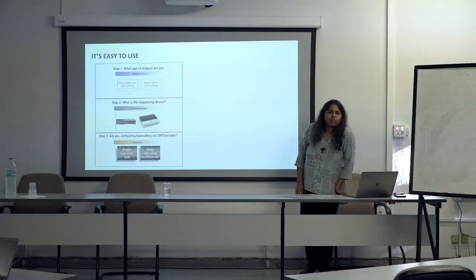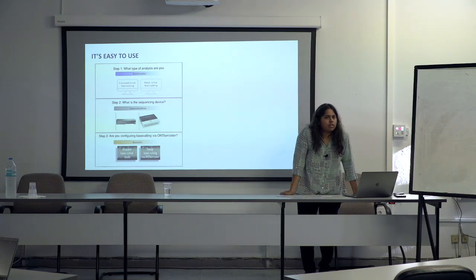Just to be clear, when people are using things like 16S, they're using the demultiplexed data set, correct? Yes. Yes.